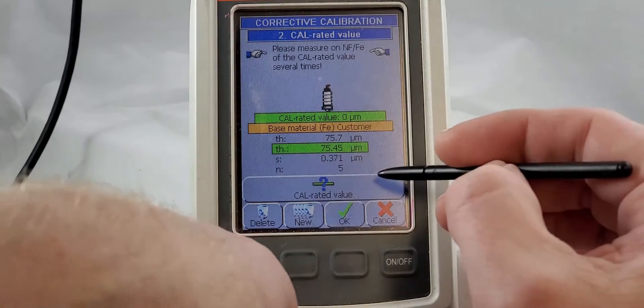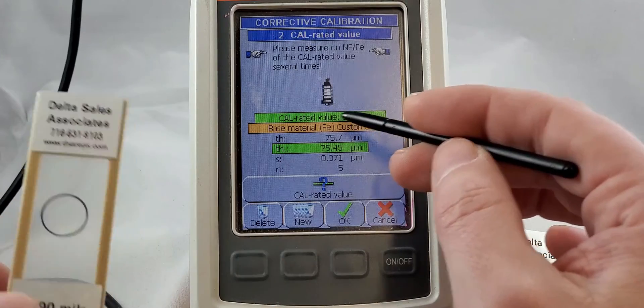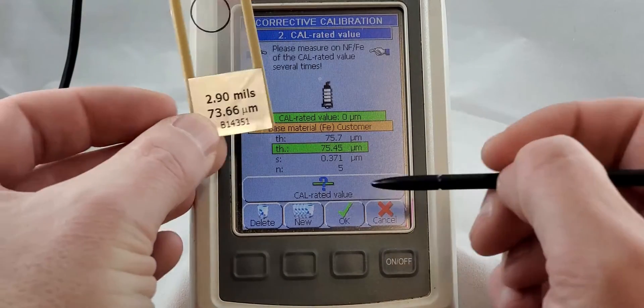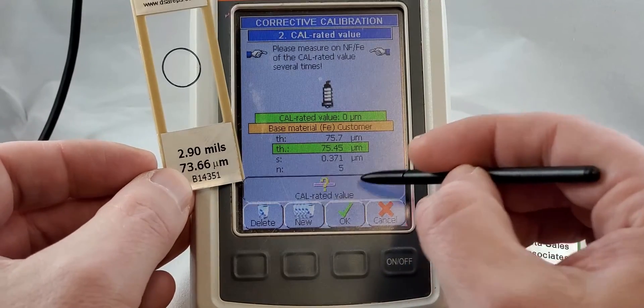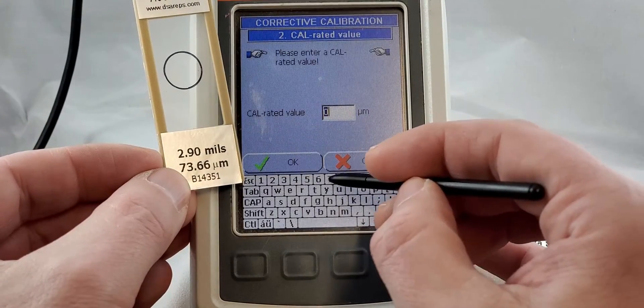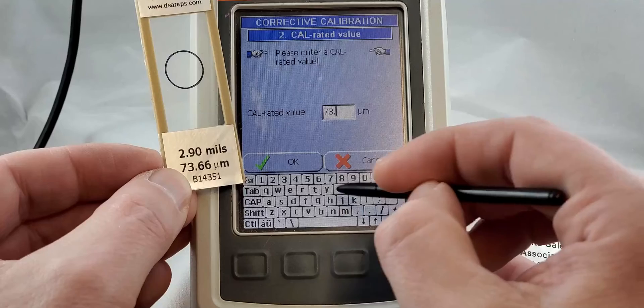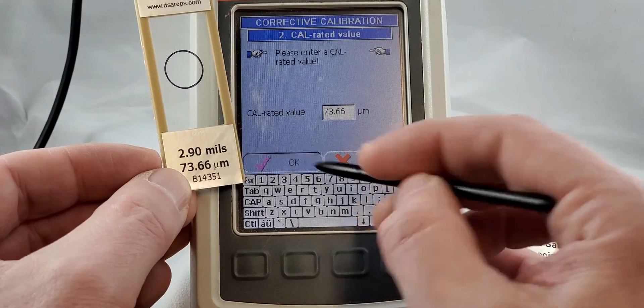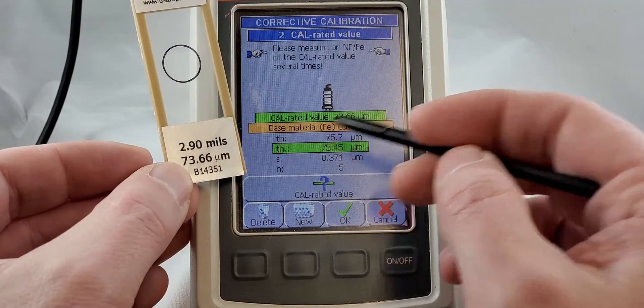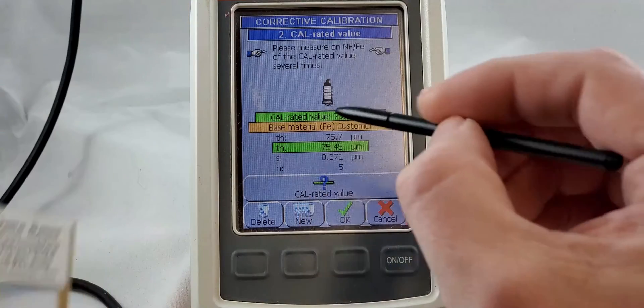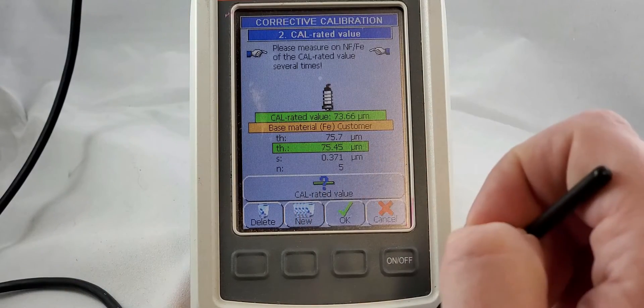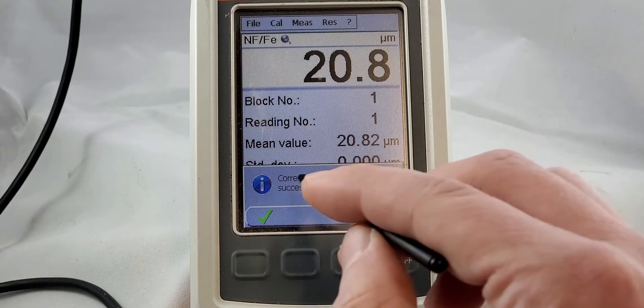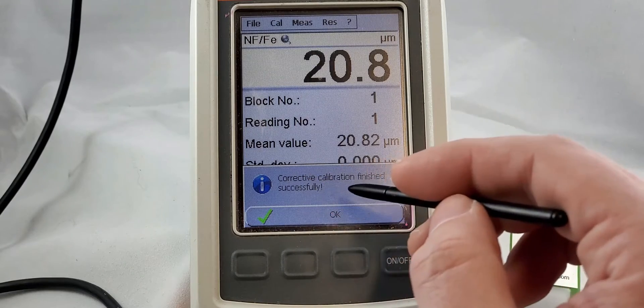Cal rated value, because obviously this is not a zero foil. We need that number. Cal rated 73.66. So now that number and that number match and we are going to hit okay. Corrective calibration finished successfully.